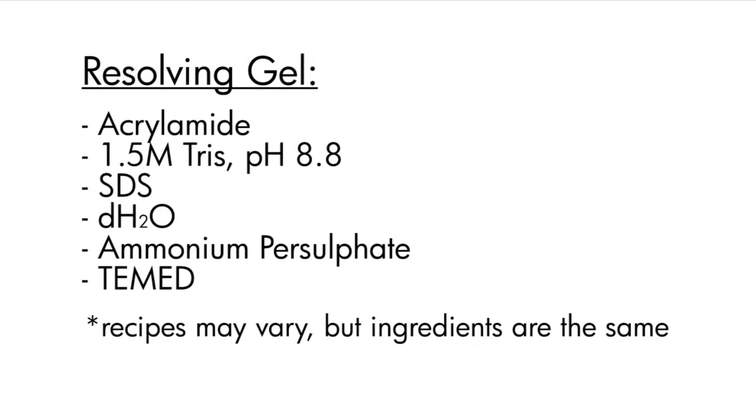Now we'll be casting the resolving gel. So I have added everything on the recipe except for TEMED. TEMED is going to initialize the polymerization reaction, so after you add TEMED, you should cast the gel right away.